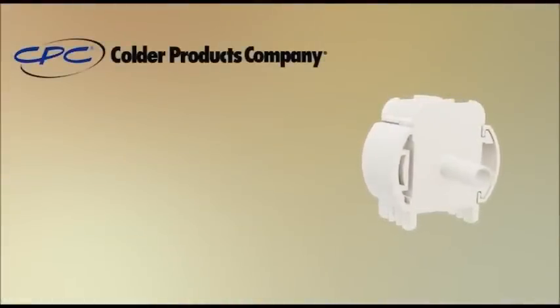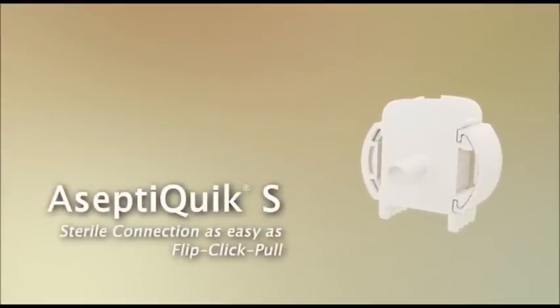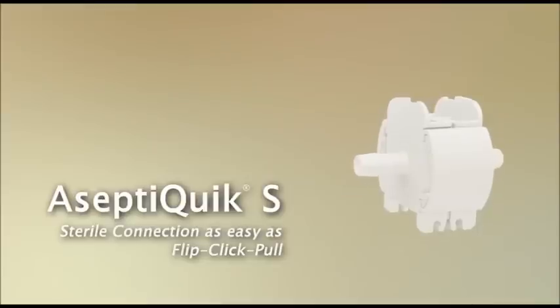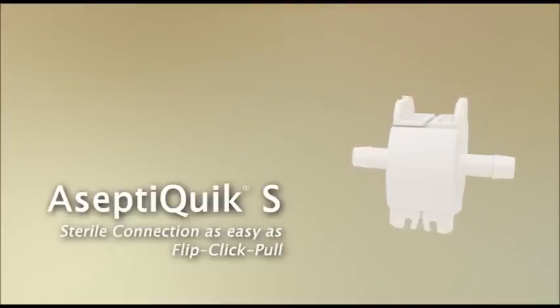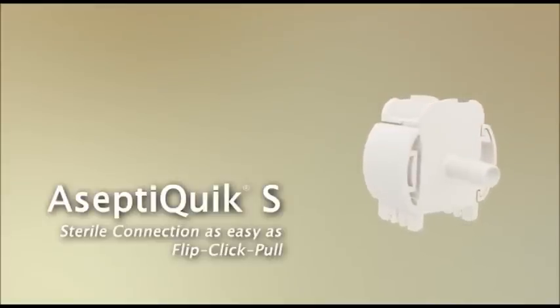AseptiQuik S Connector. Connect with Colder. Colder Products Company advances sterile fluid transfer with the introduction of the AseptiQuik S small-format sterile connector for 1/8 inch and 1/4 inch flow applications. The intuitive flip-click-pull design provides the ease of use and reliability expected from the leader in single-use connection technology.